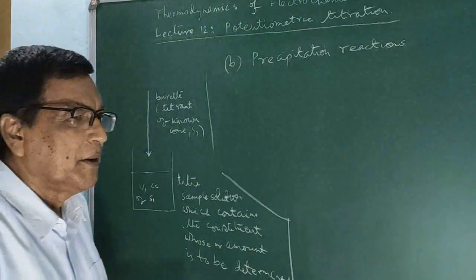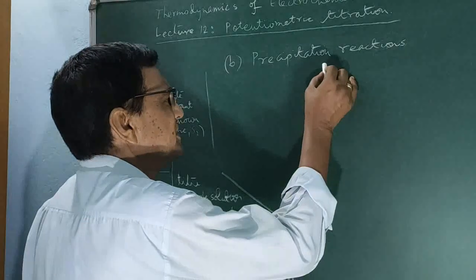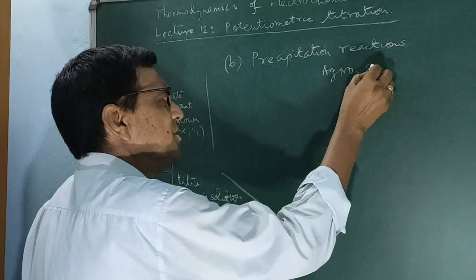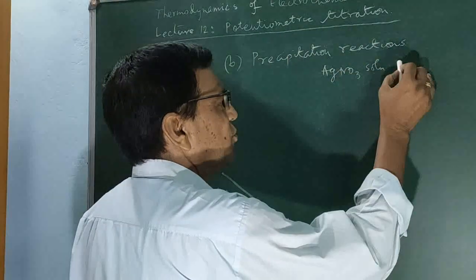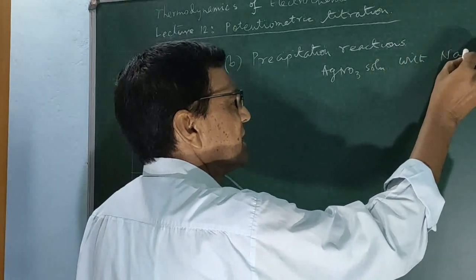One very important example is that silver nitrate solution could be titrated with sodium chloride solutions.